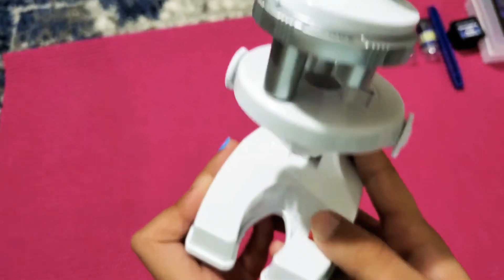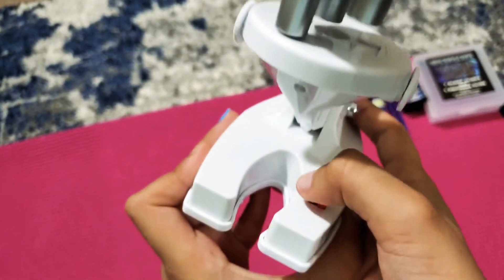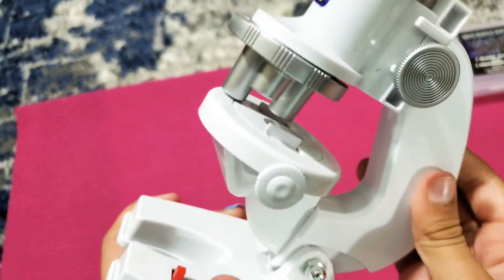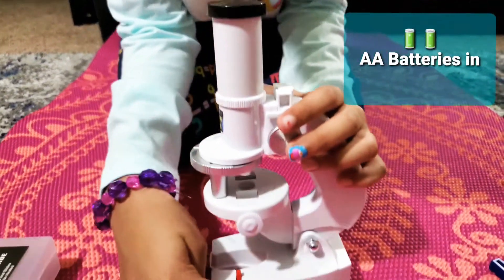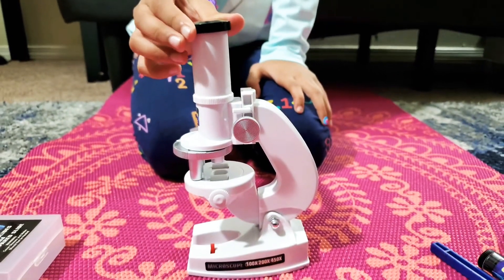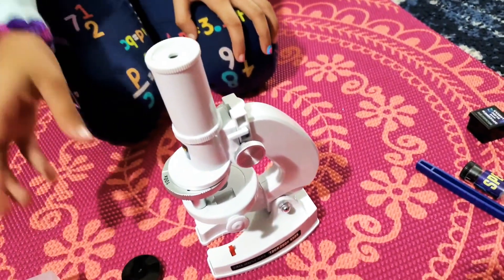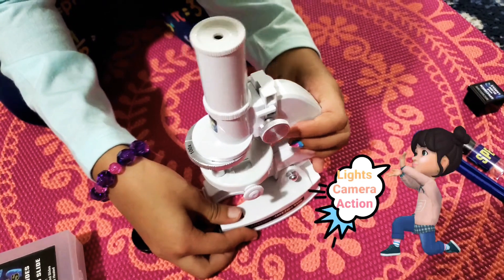Here is how it looks. This is the on and off button — this side is off and this side is on. We've inserted the batteries. We also have this little cap for the microscope, so we have to take it off to see through it. First let's turn on the lights — they're right here.